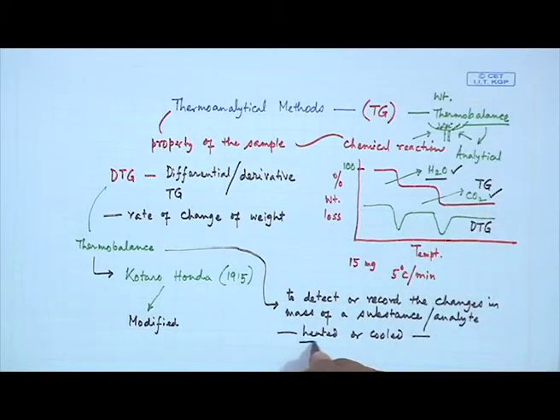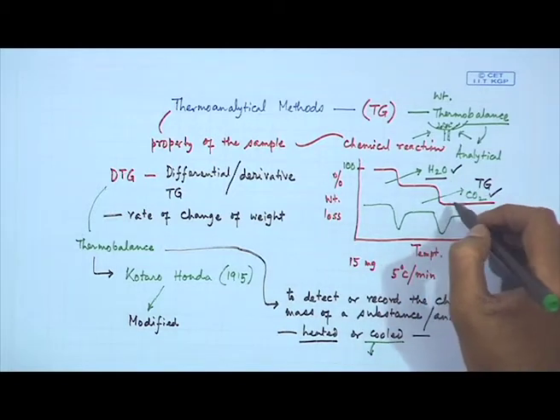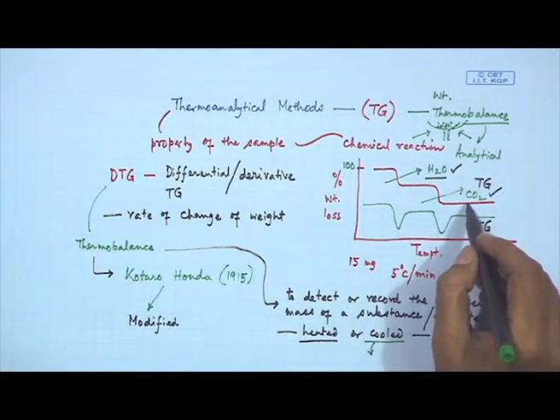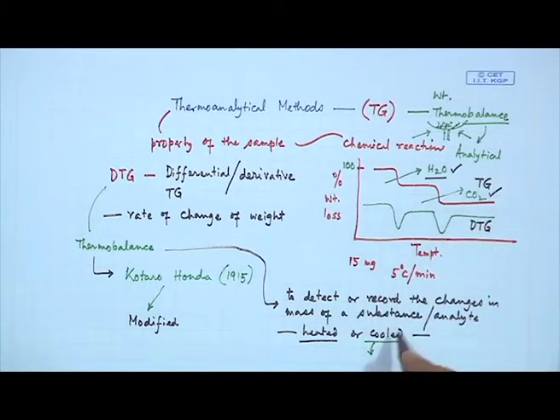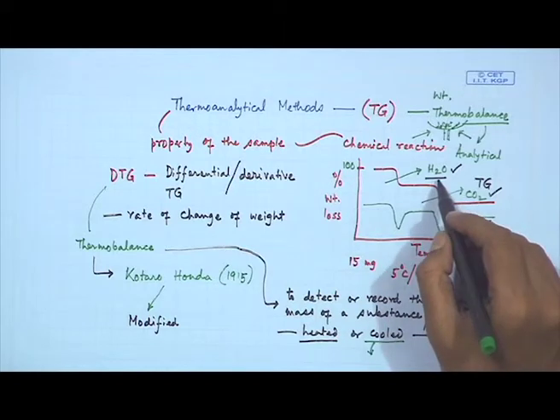During heating something is going out, but when the same material is cooled in some environment, those gaseous products which went out during heating can also be trapped back by the materials. So, when it is cooled there will be weight gain, and that weight gain is due to the entrapment of carbon dioxide or water molecules.